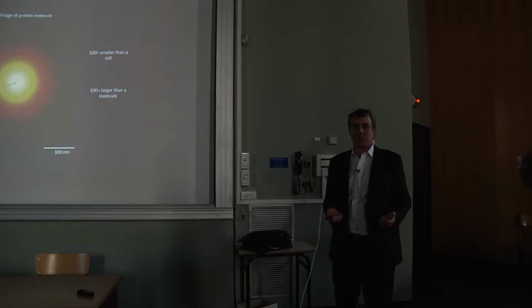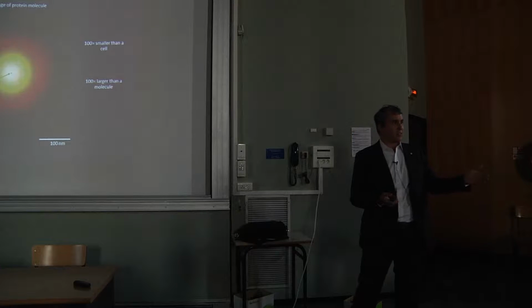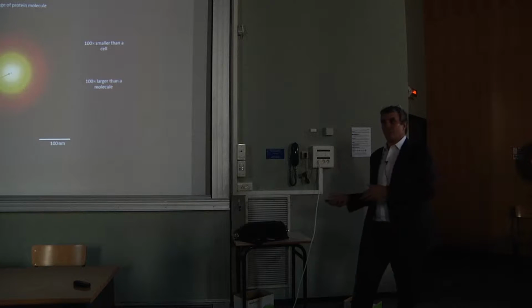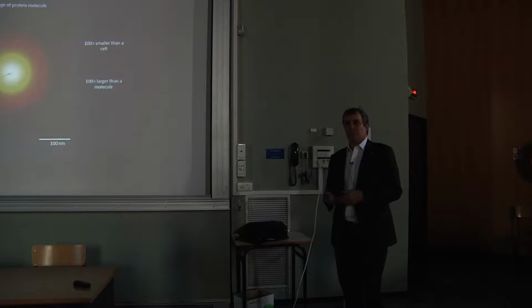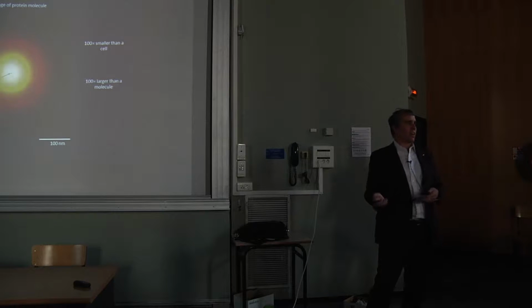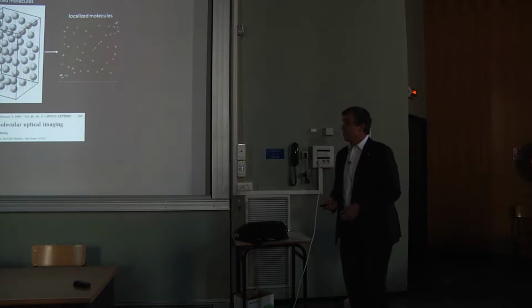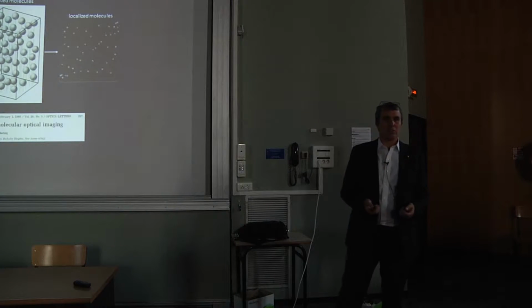So that, of course, for hundreds of years, people have learned a lot of cell biology by applying the conventional optical microscope. So in the first half of my talk, I'm going to tell you about ways to get beyond that diffraction limit. And then I'm going to turn around and talk out of the other side of my mouth and say, hey, wait a minute. There's a lot that we as physicists can contribute to make microscopes better even at the diffraction limit.